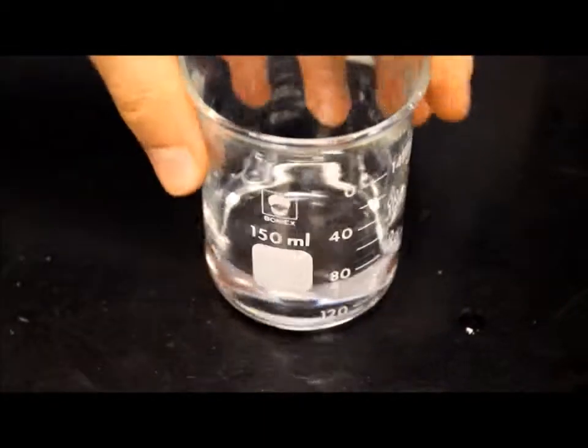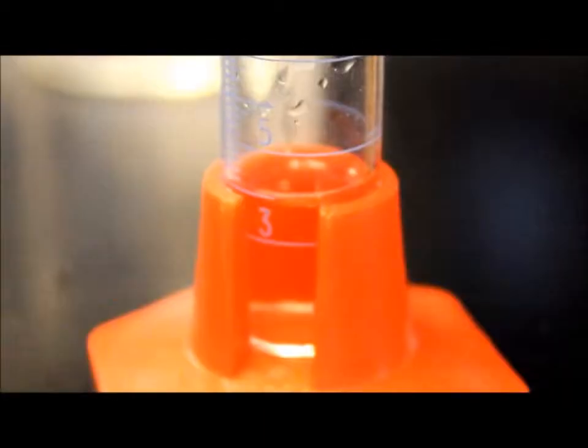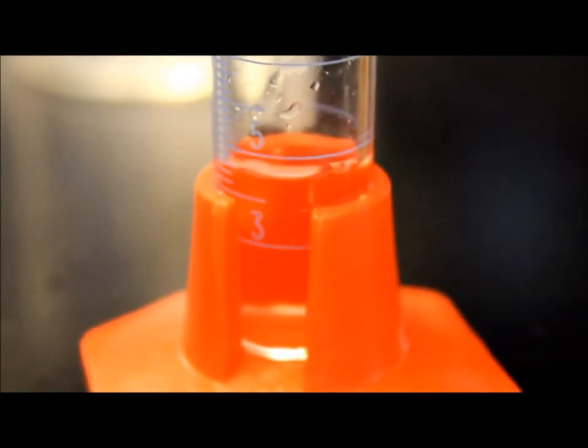Use a different graduated cylinder for each measurement to avoid contamination. Finally, measure out 5 milliliters of solution B and add this to the last small beaker.